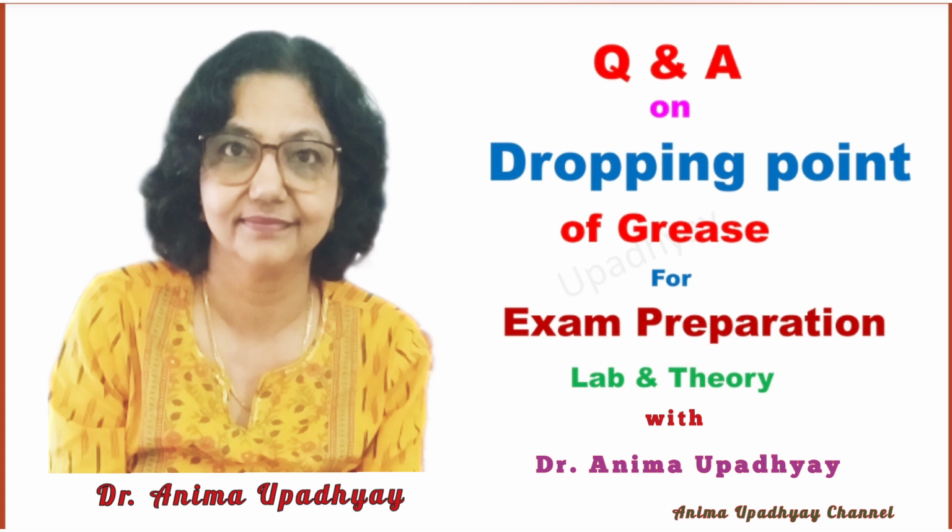In today's video, we will learn the method to determine the dropping point of grease using dropping point apparatus. I will not only explain to you the method how to determine the dropping point of a grease, but also tell you the important viva voce questions and the questions that could be asked to you in your theory exams as well.